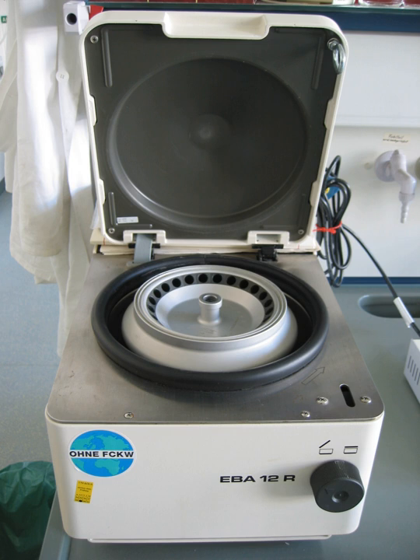While centrifuges generally have safety shielding to contain these failures, such shielding may be inadequate, especially in older models, or the entire centrifuge unit may be propelled from its position, resulting in damage to nearby personnel and equipment. Uncontained rotor failures have shattered laboratory windows and destroyed refrigerators and cabinetry. To reduce the risk of rotor failures, centrifuge manufacturers specify operating and maintenance procedures to ensure that rotors are regularly inspected and removed from service or derated, only operated at lower speeds, when they are past their expected lifetime.